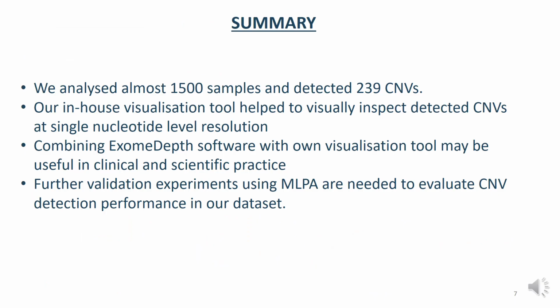Summarizing, we analyzed almost 1,500 samples and detected more than 200 CNVs. Our in-house visualization tool helped to visually inspect detected CNVs at single nucleotide level resolution. Combining ExomeDepth software with our own visualization tool may be useful in clinical and scientific practice. However, further validation experiments using MLPA are needed to evaluate CNV detection performance in our dataset.